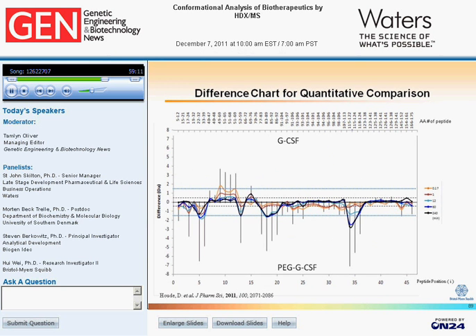You can see that there are multiple regions along the protein sequence that show significant differences in HDX level between the two proteins. But when we take a closer look, these regions do not include the binding regions. Therefore, the biological activity of the protein may not be affected by pegylation. Next slide.